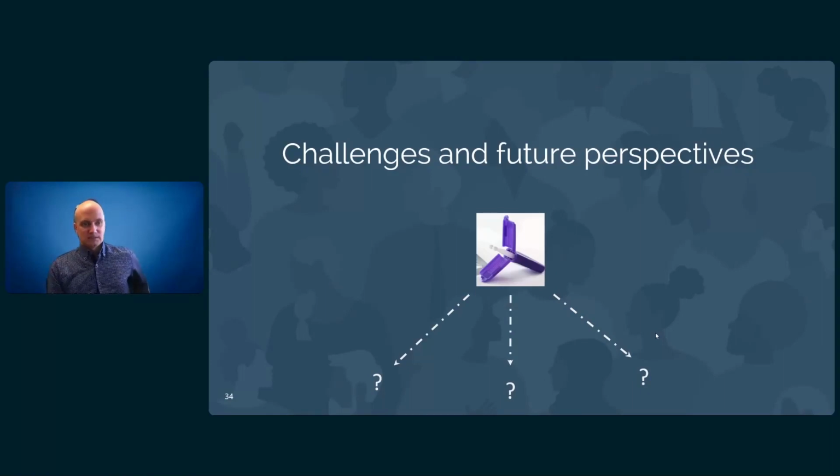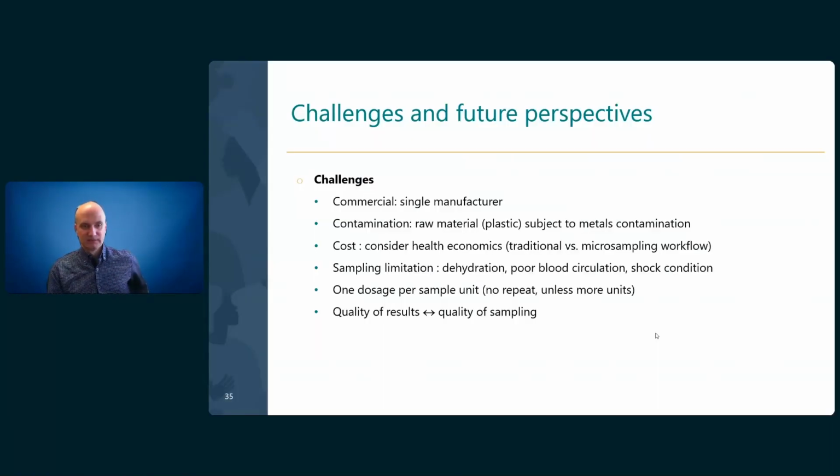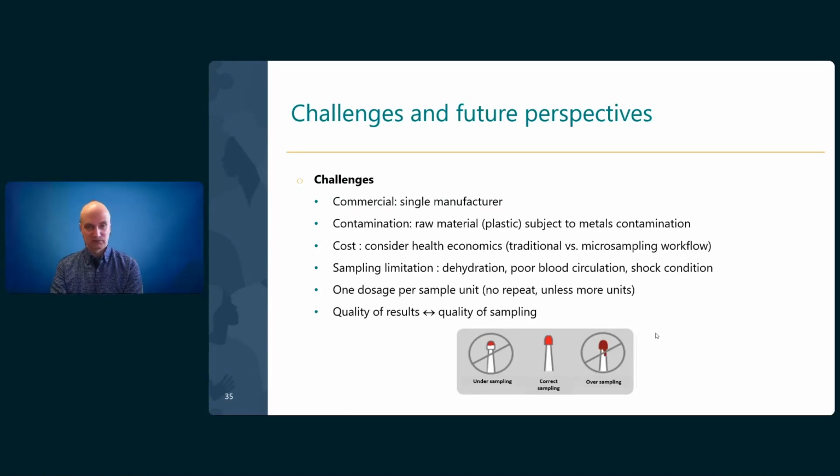Okay, let's talk a bit about the challenges and future perspective. Among the challenges I want to share with you today, the first one is, let's say, a commercial one, because there is only a single manufacturer for these devices. So if there is a contamination, for example, the raw material, the plastic, could be subject to metal contamination. So this becomes a limitation.